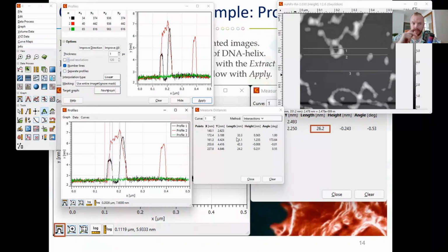That's why we can measure, for example, the thickness of one graphene layer or one MXene layer, but we cannot measure very precisely one atom, or let's say clusters, like tens of atoms, because the tip will start filling up and approaching this cluster's width like this.